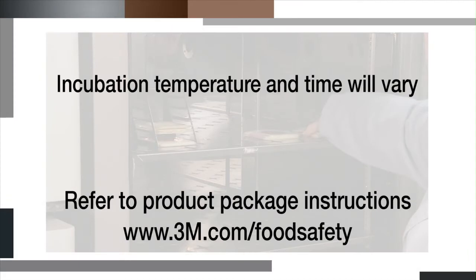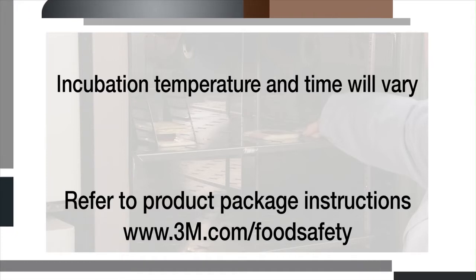The temperature of the incubator and the amount of incubation time needed will vary depending on which method you're using. Refer to the product's package instructions for specific information, which can be found on our website.